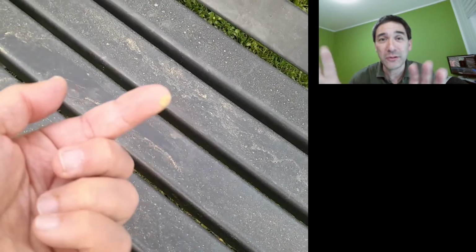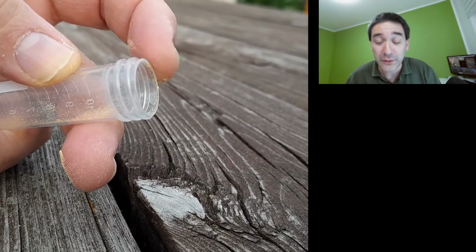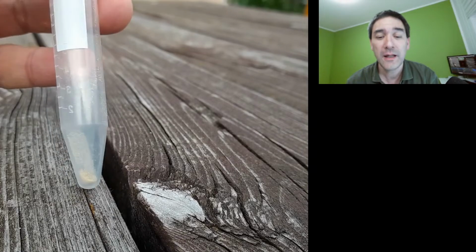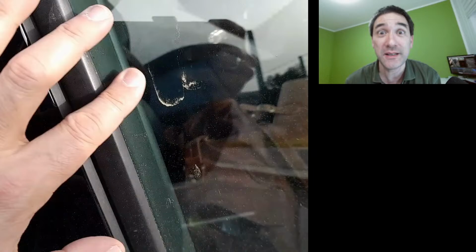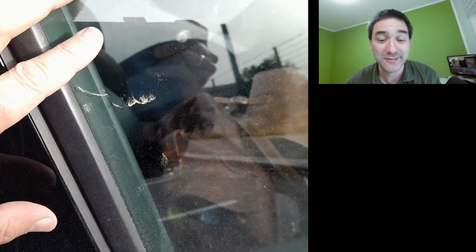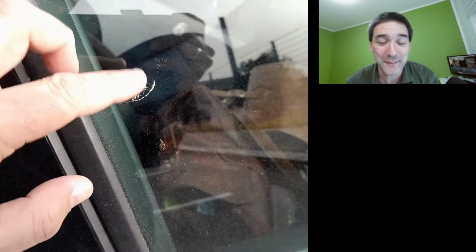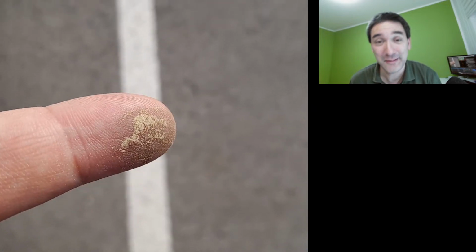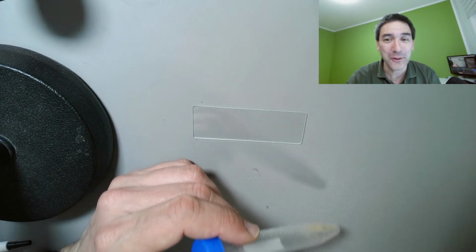Even if you look on the horizon, you could see it was slightly yellowish. There was quite a bit of haze around, and then I found all of these things and collected them. Here is the tube, and I said, "Cool, I'm going to put some Sahara sand under the microscope." Big disappointment. It's not Sahara sand. You might have already guessed what it is. Yeah, it's pollen time. So unfortunately no Sahara sand, but I said, okay, I'm still going to put it under the microscope, and so here we are.